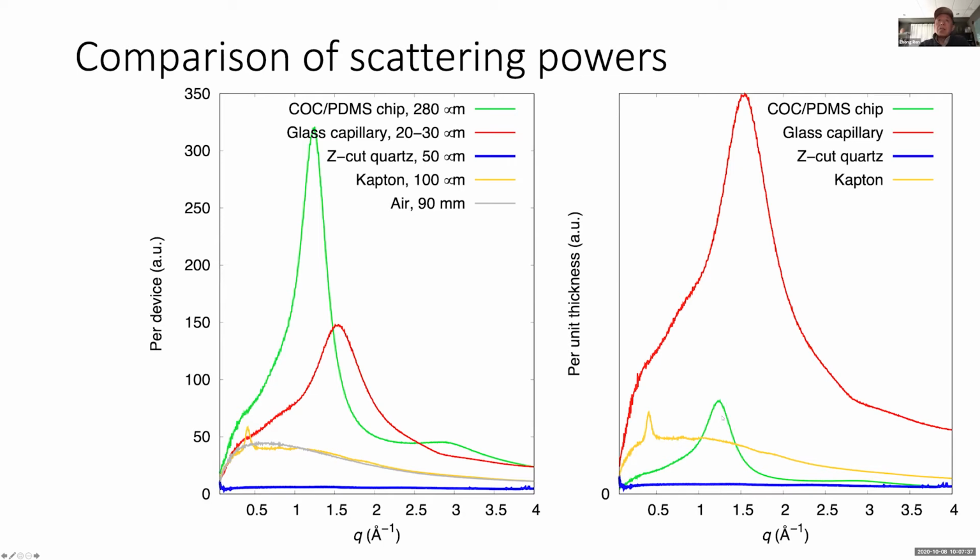But it's not very realistic to make a very thin device out of this material. You will have to make it a couple of hundred microns, even more.